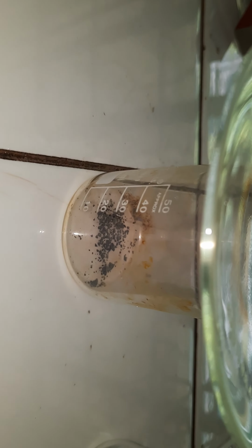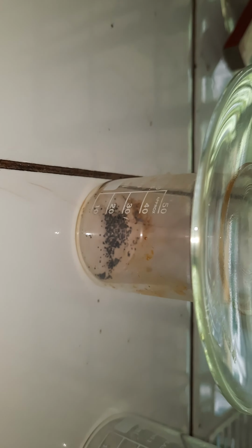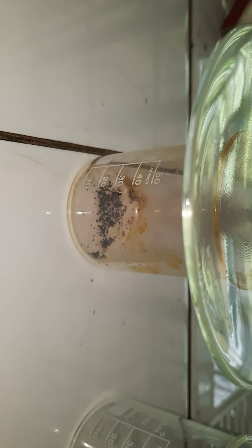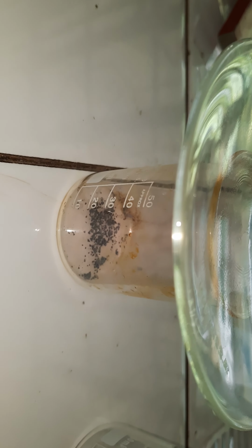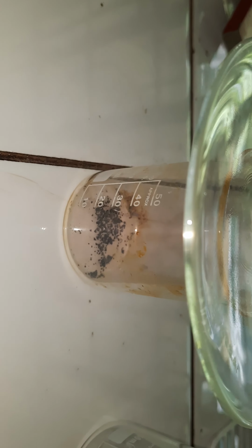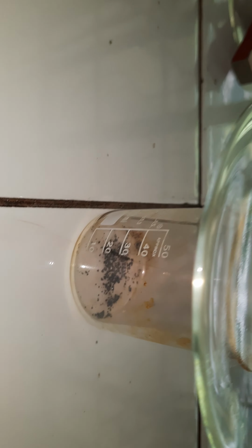Okay, take note of your observation, and to give an explanation to this, study the concept of sublimation for you to be able to explain what happened in this sample of iodine as it fills the walls of the container or the beaker with this cloudy residue.